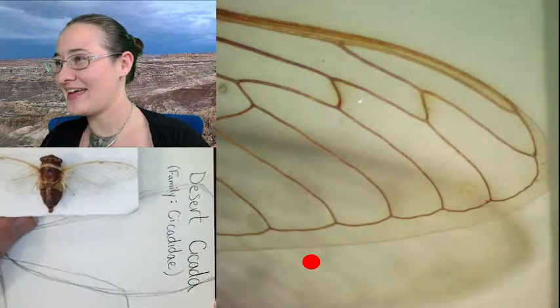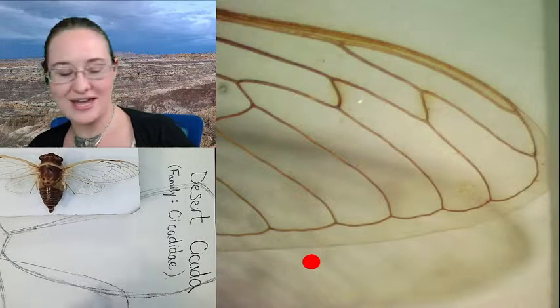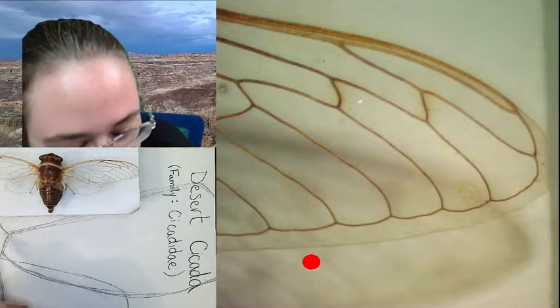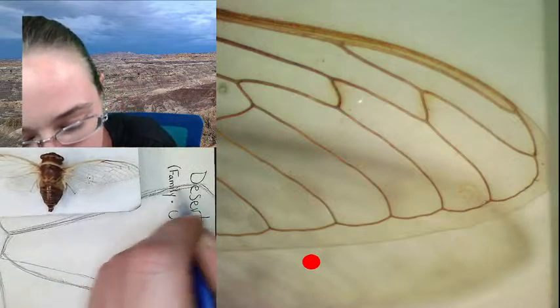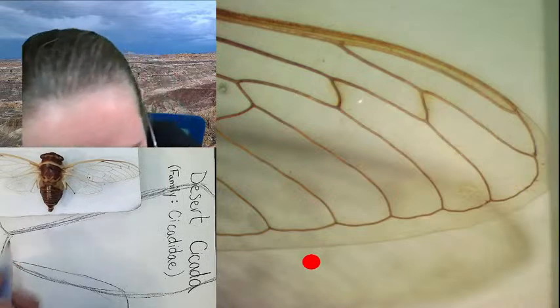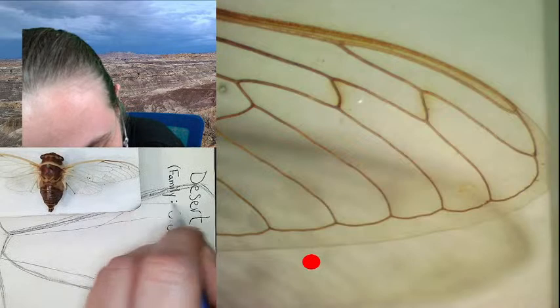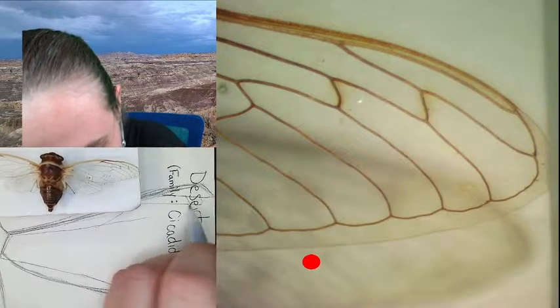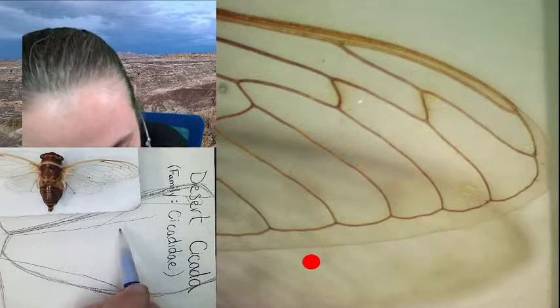Alrighty. Let's see. Get that all set up. Now I'm going to go ahead and start sketching some of these veins. The costa is this first one, the nice thick one at the top. One, two, three, four, five, six. And then these all come out to these scalloped edges.